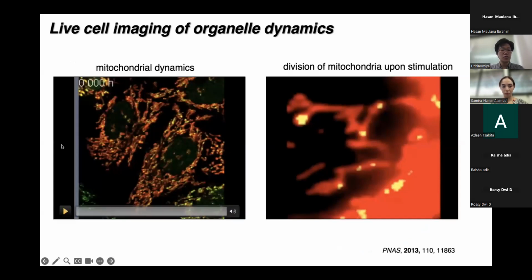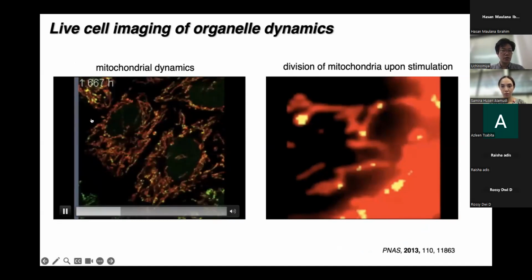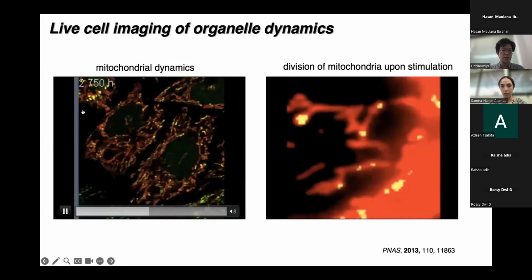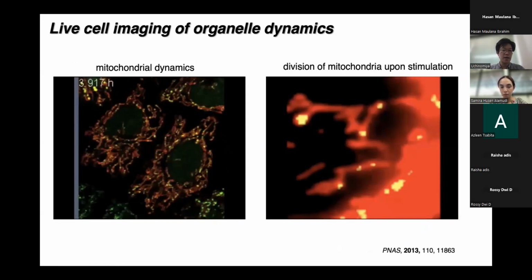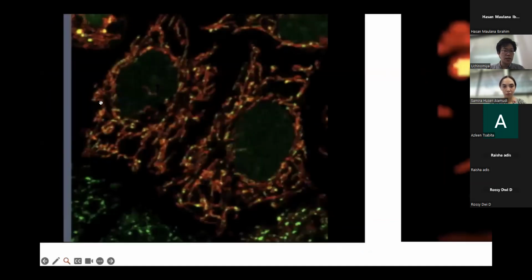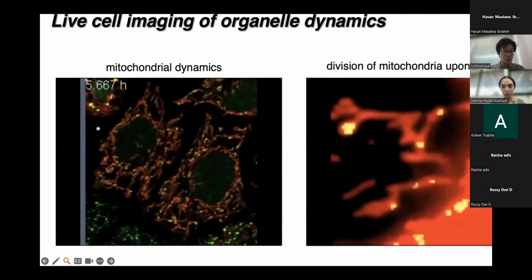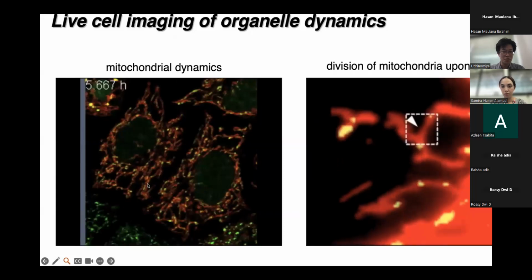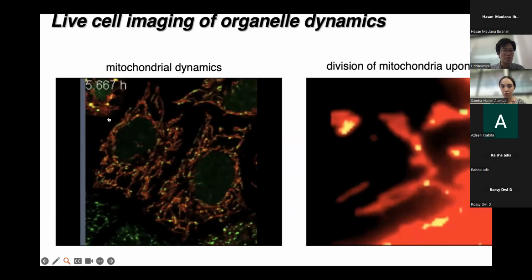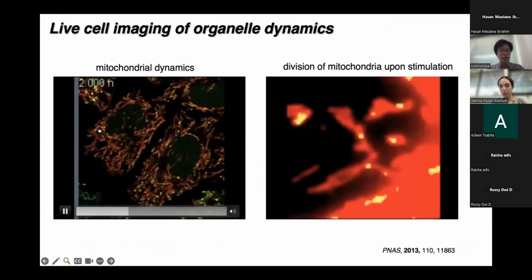So I will show you the movie of the live cell imaging. Okay, so like this, this is a live cell image of mitochondrial dynamics. And as you can see, oh, please wait. Okay. So as you can see, the mitochondria are moving.